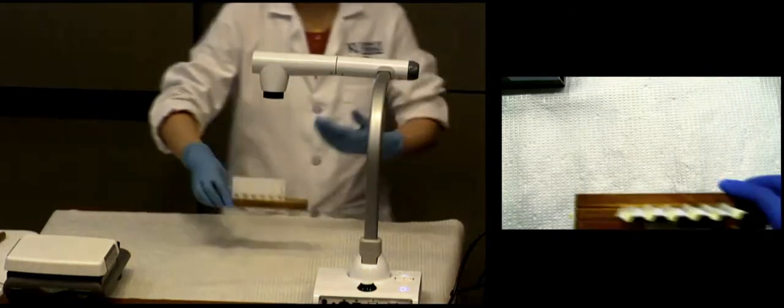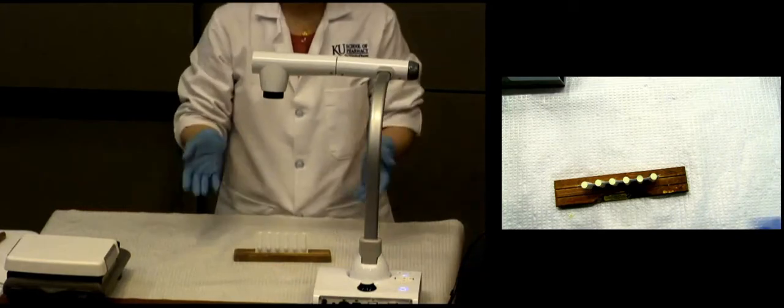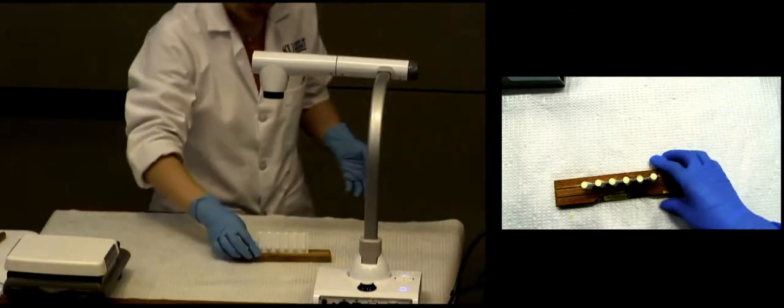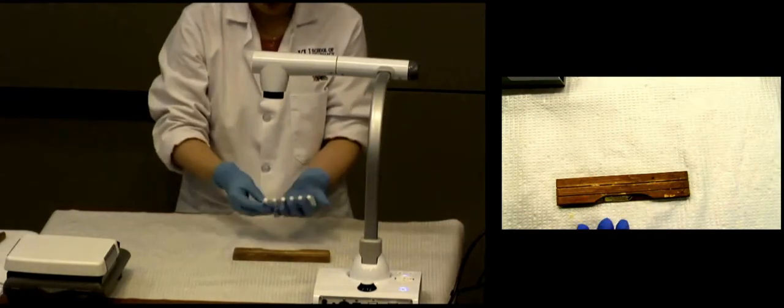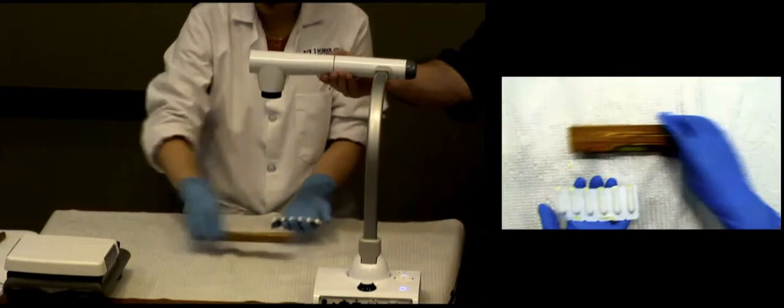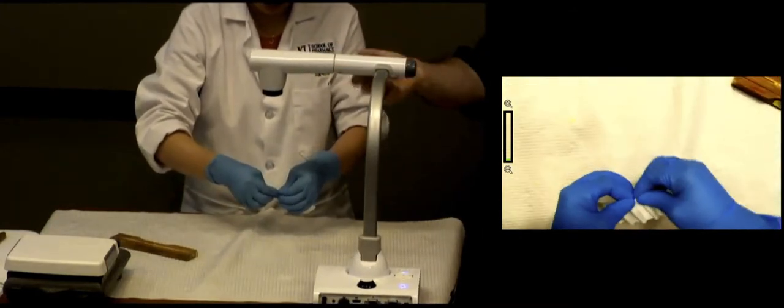All right, 20 minutes later, you don't get to write this procedure, right? So this is our 20 minutes later, all right? Finally, it's solidified already. Okay, we can take out from our mold there, and we can observe, look very good there. All right, so I'm ready to prepare this for my patient.